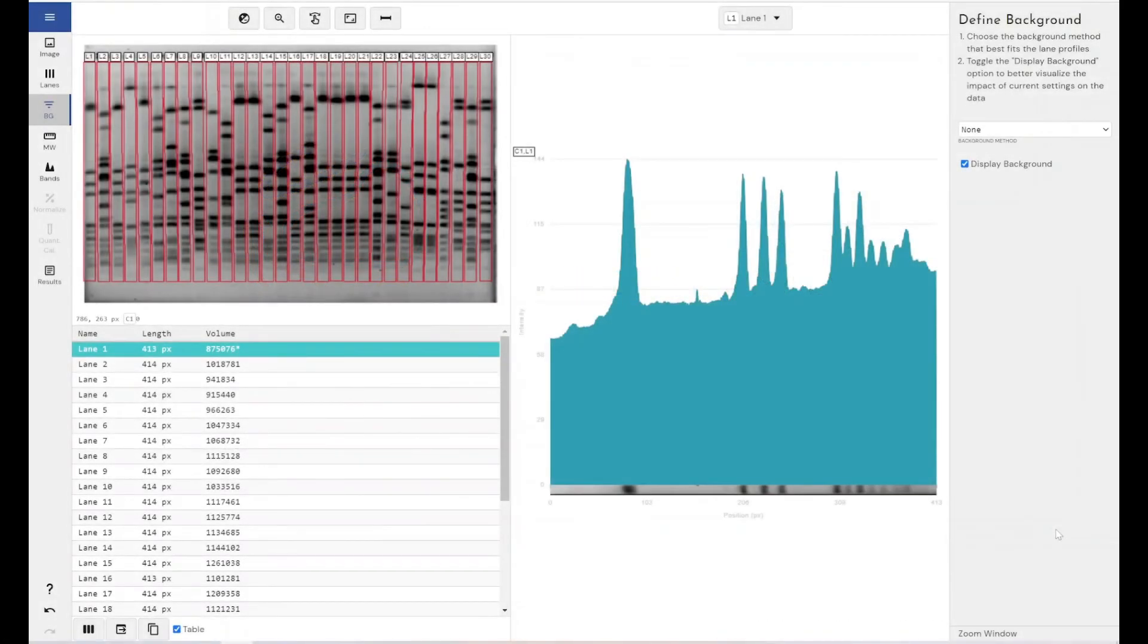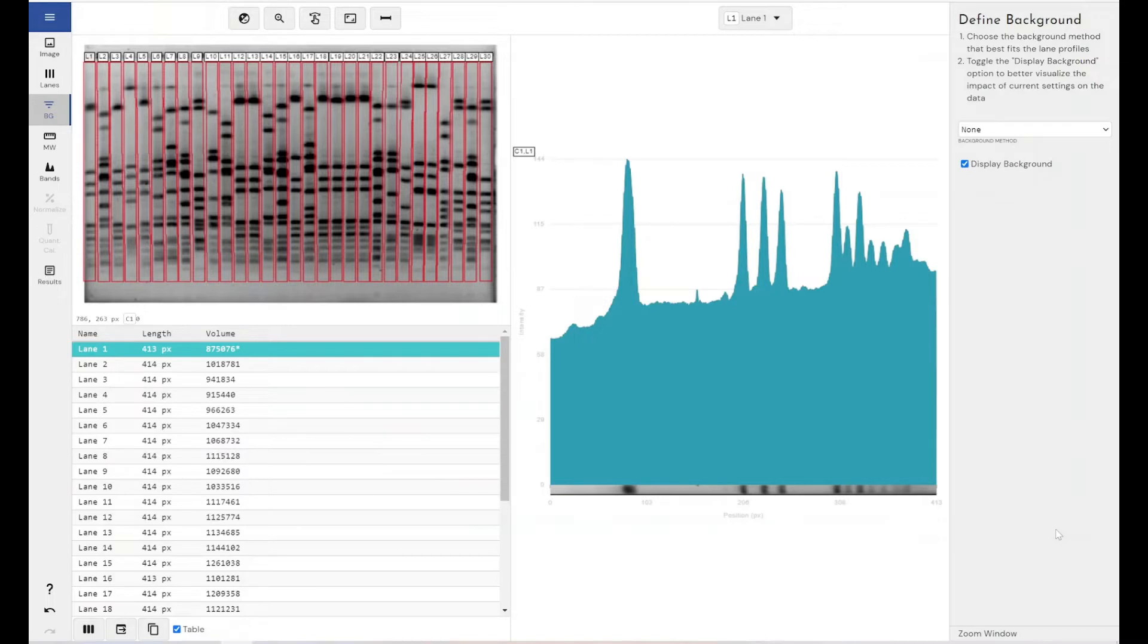So I've taken you through here to the background removal section of Phoretics 1D, where we make the decisions and change the settings which is going to decide what we determine as background and what we want to remove.